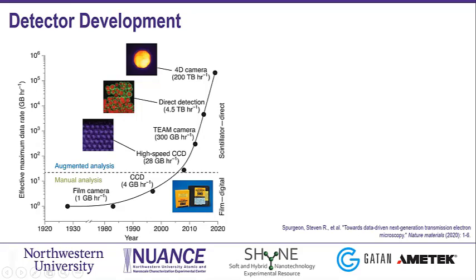For example, today, the detectors that we have here at Northwestern can collect roughly 4 terabytes an hour if you are constantly using them to collect either images or diffraction patterns.